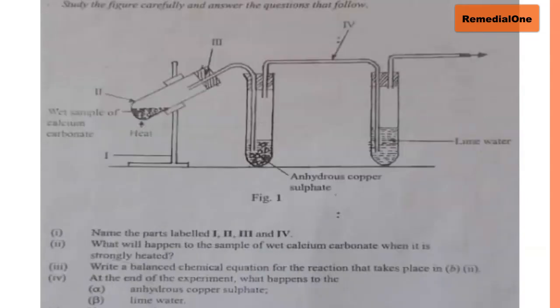And when it escapes, it will pass through the delivery tube here, and then enter this test tube containing lime water. And lime water will turn milky whenever it comes into contact with carbon dioxide. So at the end of the day, because we are producing carbon dioxide, it will turn the lime water milky. So that is what will happen to the lime water at the end of the experiment.